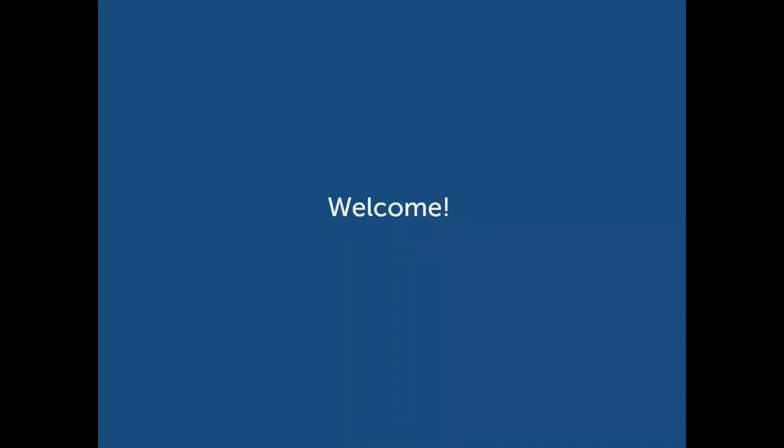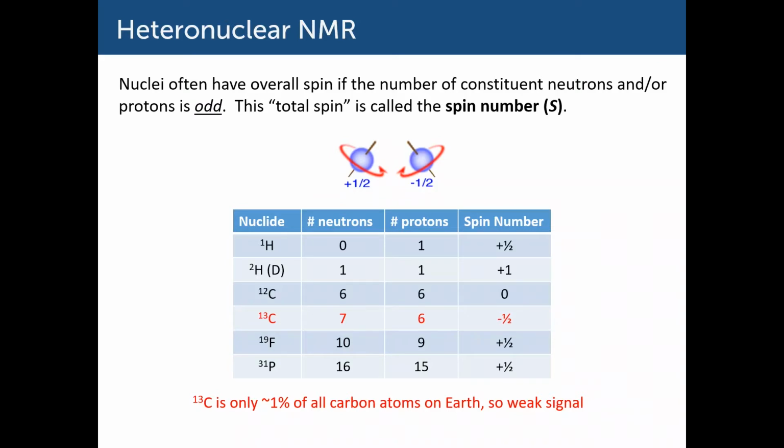Welcome to our fifth video on NMR. In this video, we'll be focusing on NMR of carbon atoms rather than hydrogen atoms. And at the end of this video, we'll follow up with a small vignette on some advanced topics in chemical shift analysis for all types of NMR, but focusing on protons. So let's deal with what's called carbon NMR first.